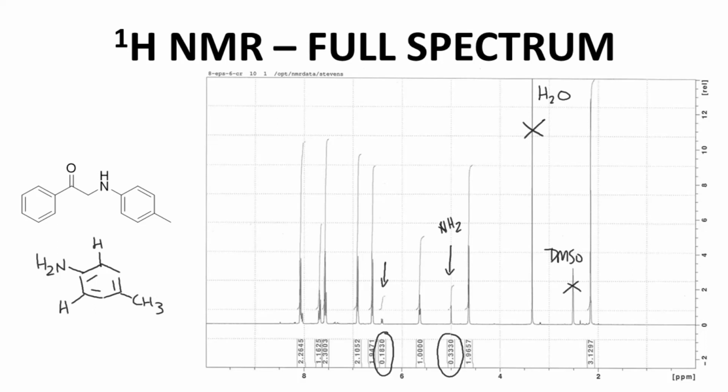The NMR of the recrystallized material looked essentially identical to this same spectrum. Same impurity peaks and nearly identical relative integrations. That was a sure sign that I did not understand the situation. The proposed impurity, para-toluidine, should be very soluble in ethanol and easily removed through a recrystallization. Let's go back to the TLC plate.